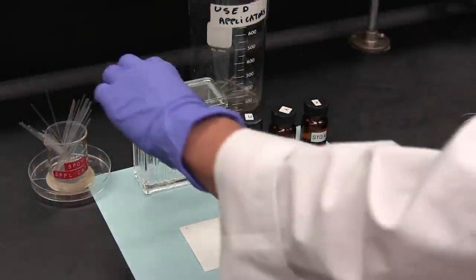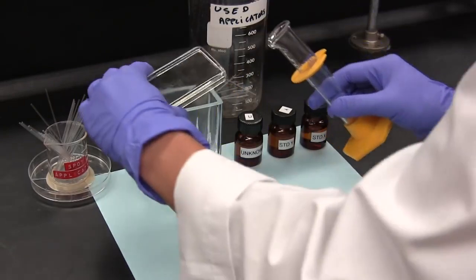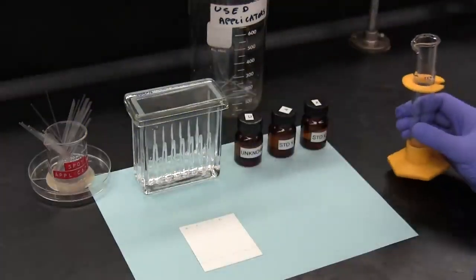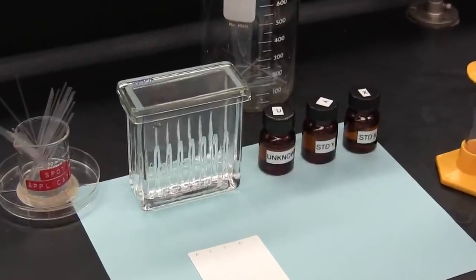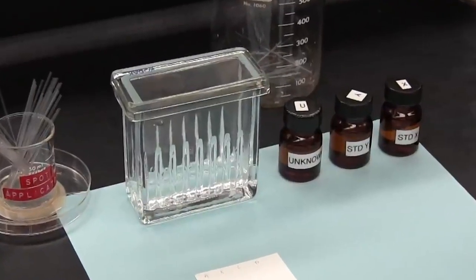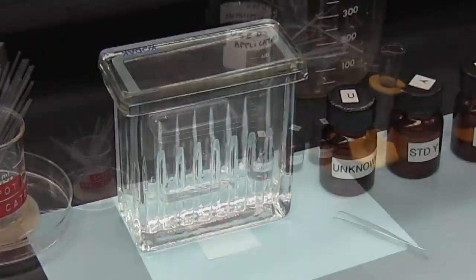A pre-measured volume of a suitable solvent is added to the developing chamber. You'll normally be told which solvent to use. The developing chamber is covered with a lid for a few minutes, and this few-minute waiting period allows the atmosphere inside the tank to become saturated with the solvent vapors.